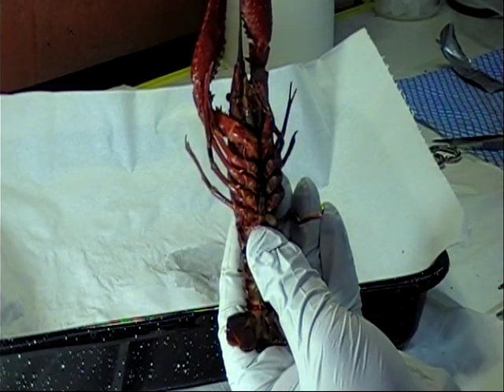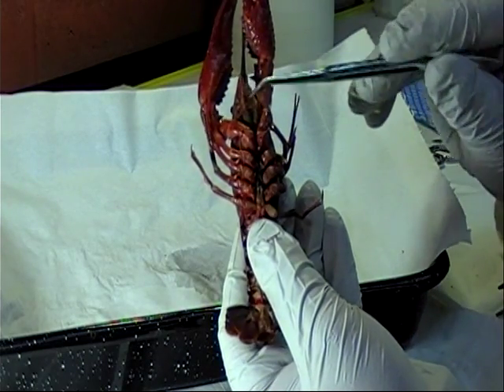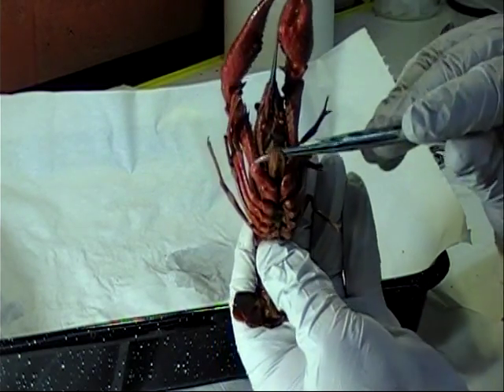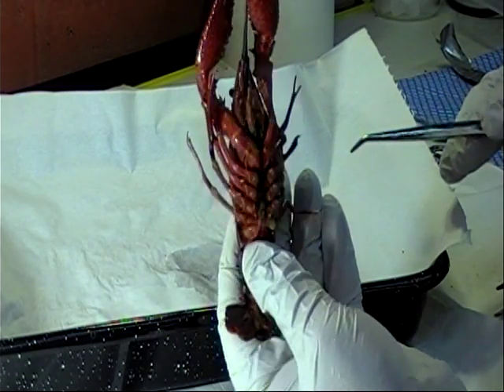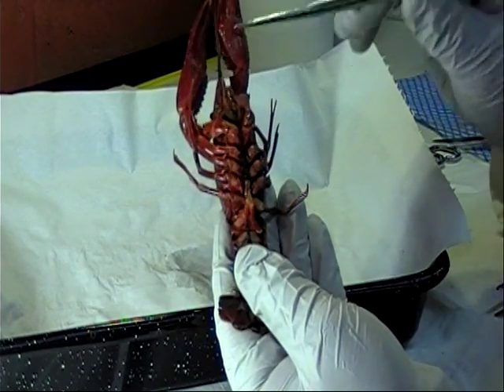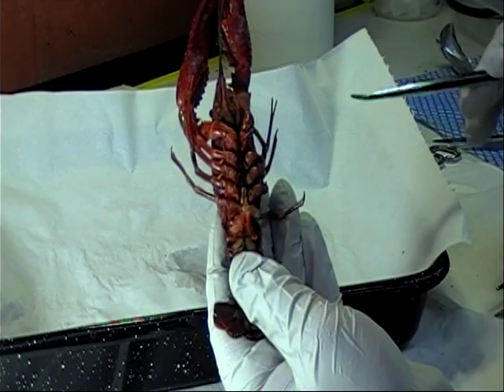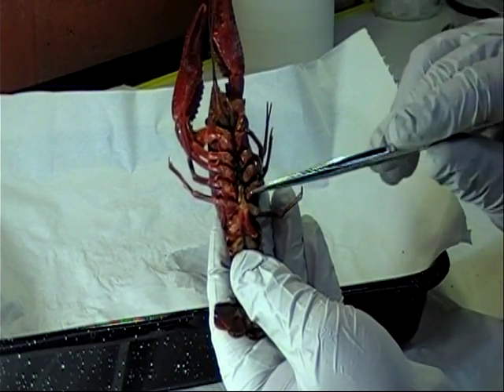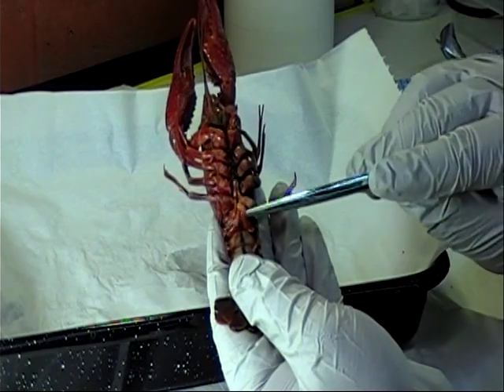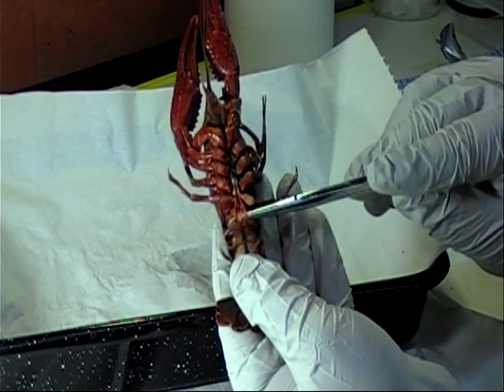Moving on to the thorax, we can see the maxillipeds, which are the first three appendages on the cephalothorax, used for holding food. We can also see the chelipeds, which are the large claws used for defense and capturing prey. The four remaining segments contain the walking legs. We can also determine the sex of the crayfish by looking at the walking legs — males have an extra set of appendages.